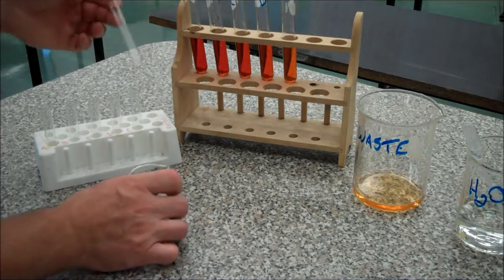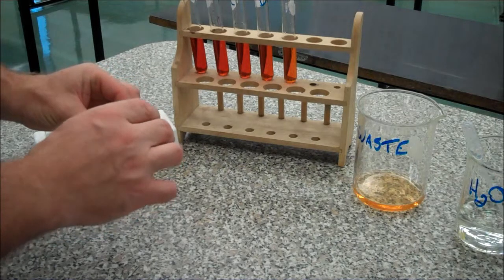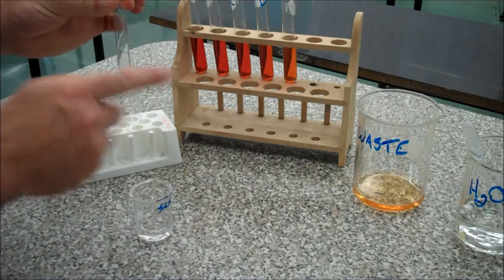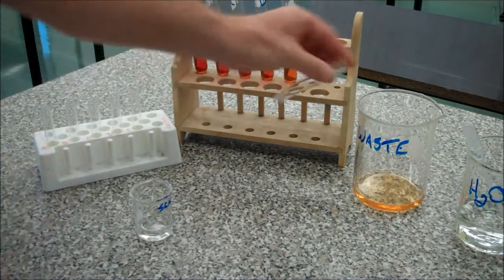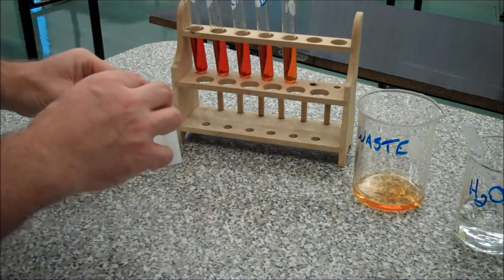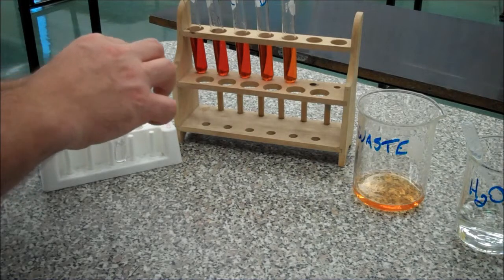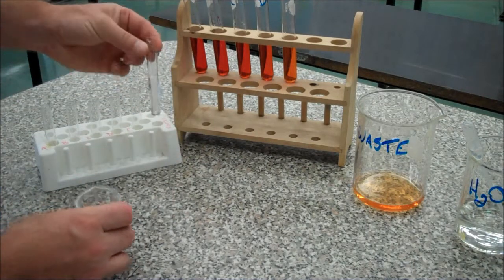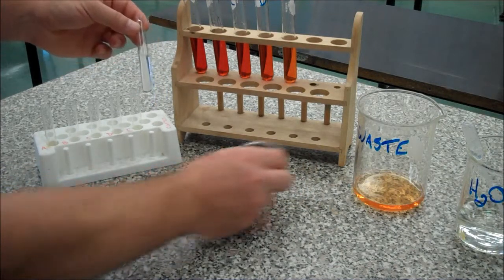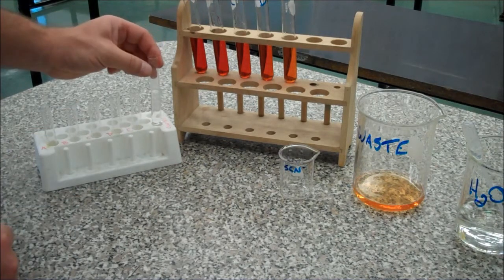So my control is going to be this one — it is the thiocyanate ion, one of the solutions that we used. I am going to equilibrate my glassware, which means I'm going to rinse it — same as we always did — everything goes into the waste. Now I'm going to fill it up about two-thirds full. That's about half, I guess. Anyway, I'm out of my reagent, so that's good enough. My control will be the same for every single one.